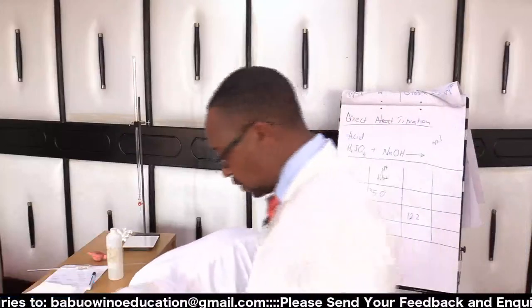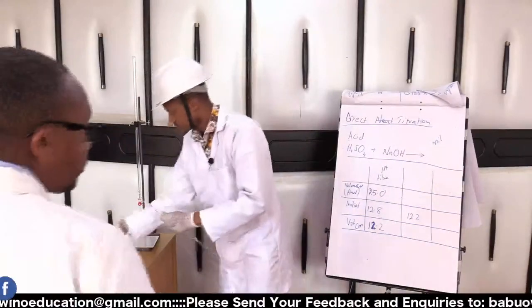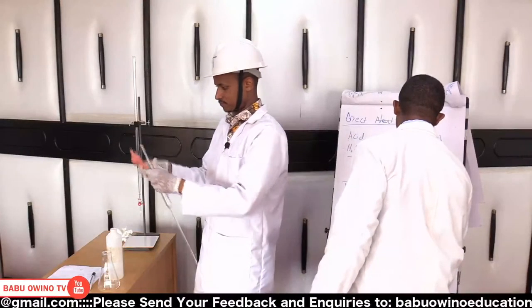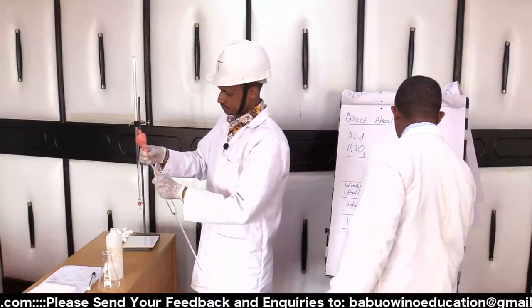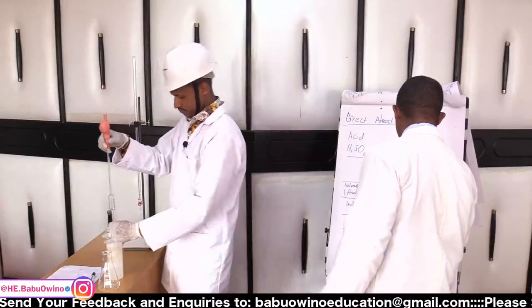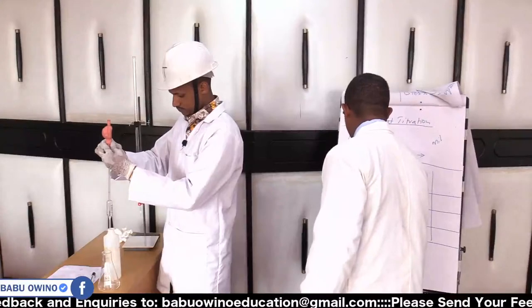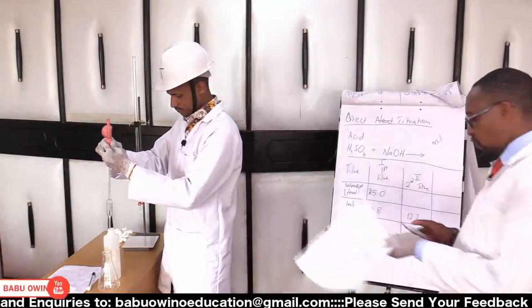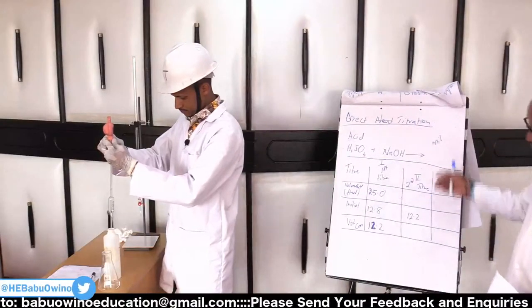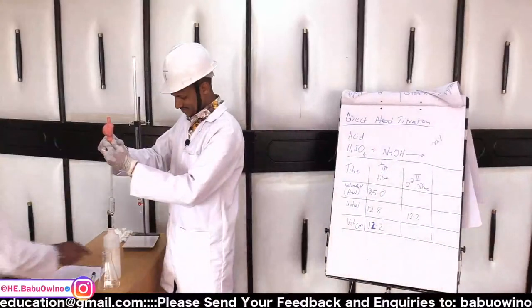Don't release it. We titrate again. So this is our second titer. Titer number 2. Or you can simply call it second titer. This is the first titer. These are the titers. And therefore, this is titration. And this is volumetric analysis. Big name to scare you, but little stuff.